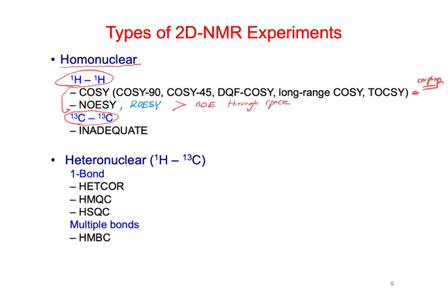And then there's this C13 experiment, which is kind of cool, but it's not used very often, largely because C13 natural abundance is so low that to do this you need two C13 atoms next to each other, and so the statistical chance of having that happen is even way lower. Right, so it's very insensitive unless you have some sample that has C13 labels in it.